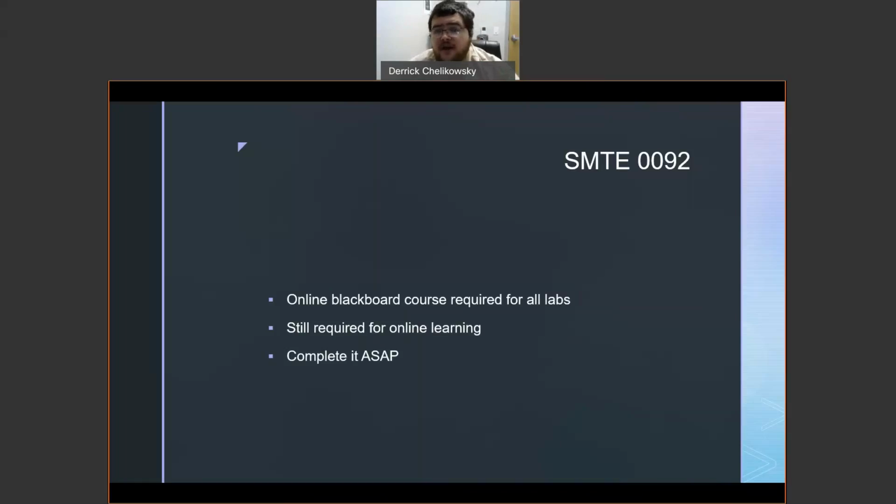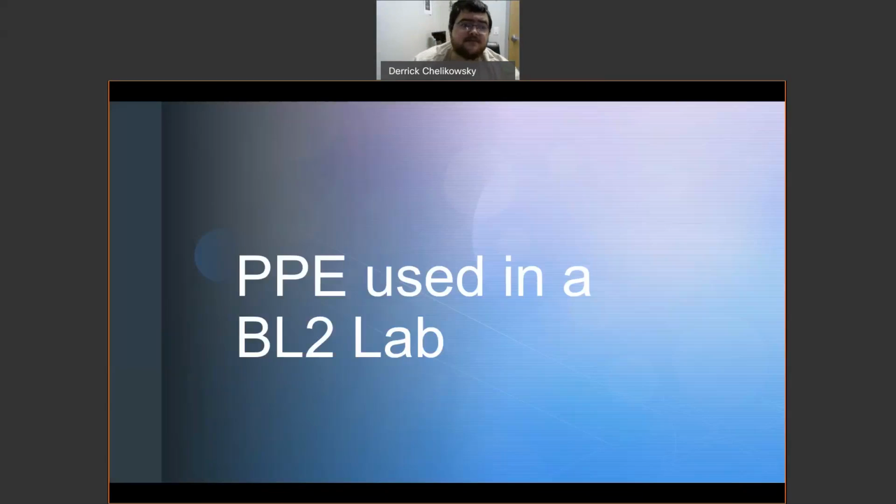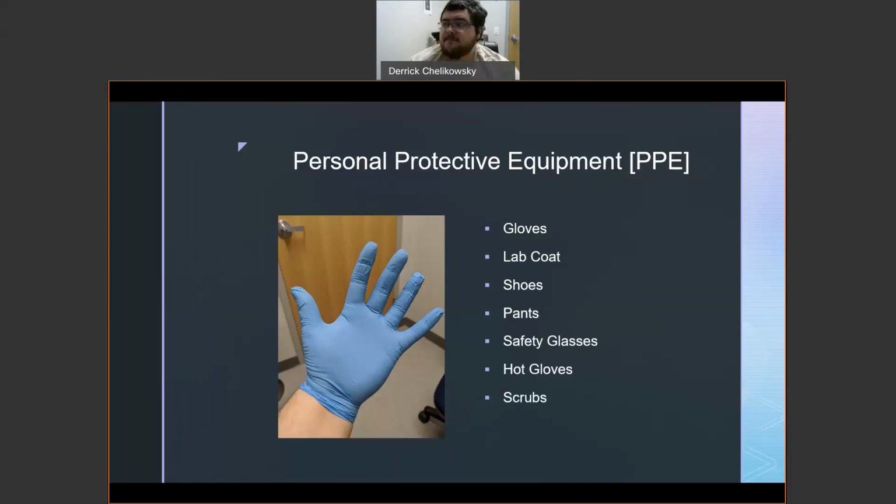I do encourage you to follow along on this PowerPoint. This PowerPoint is up on Blackboard. So we're going to start with some personal protective equipment, or PPE, used in a BL2 lab. The first big one we have is gloves. Lab coat, shoes, pants, safety glasses, hot gloves, and scrubs. You don't use all of these at the same time, but they are necessary.